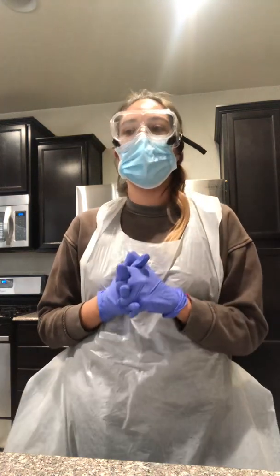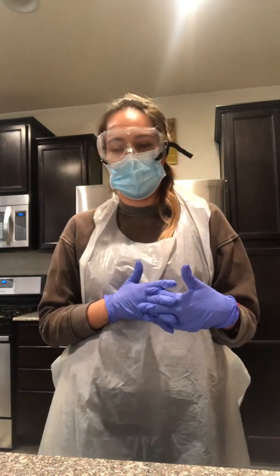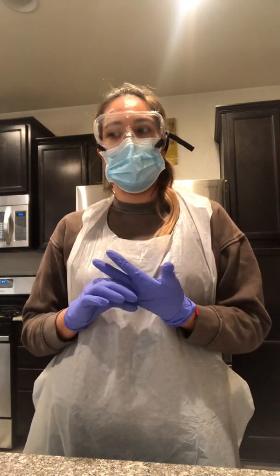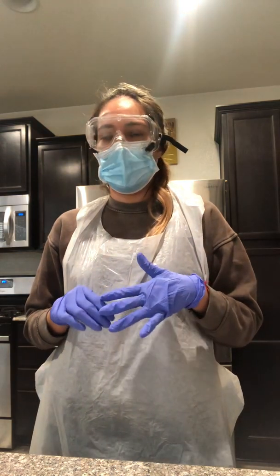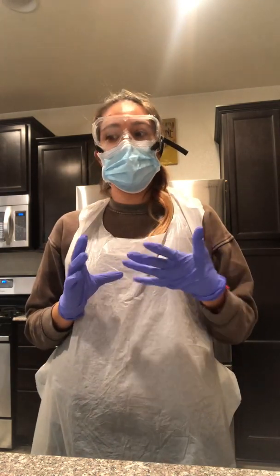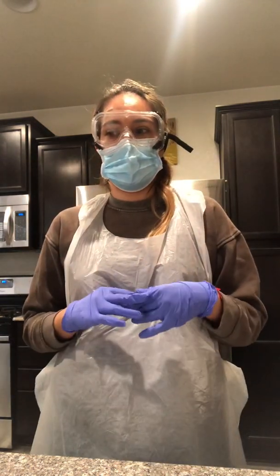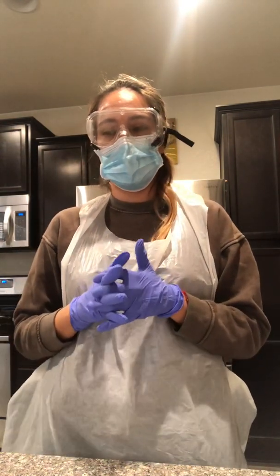And for question number 3, describe any experimental errors that occurred and how these might be avoided in the future. One of the problems that I had with this experiment is that I couldn't get the yeast to froth. I tried using hot water, warm water. I used a fork, and I made sure I let it sit for 10 minutes, and it just wouldn't froth. So I'm not sure if I missed something, or maybe there was a defect with my yeast, I'm not sure.